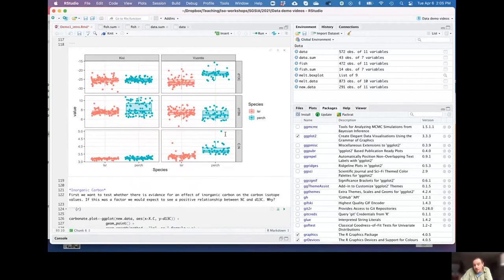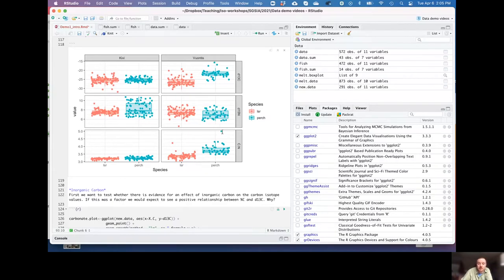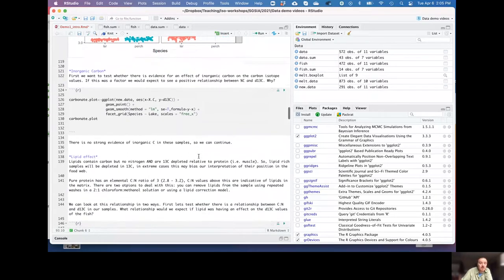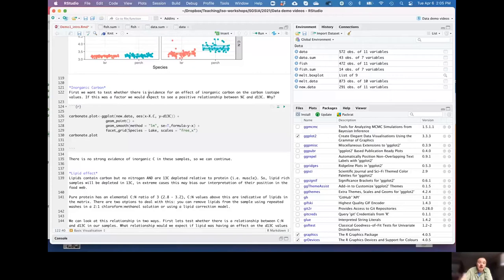A high C:N ratio is an indication of a lot of lipid in the sample — that's something you'd want to go in and check. We may also want to consider whether we're dealing with inorganic carbon contamination, particularly if you've got invertebrates, especially in a marine environment. Inorganic carbon will have an isotope ratio very similar to the VPDB standard, so it will draw your values towards zero.